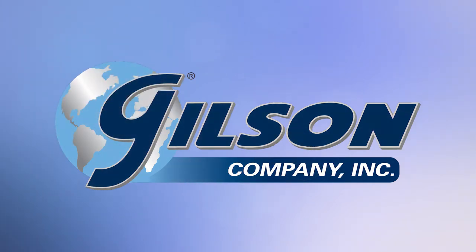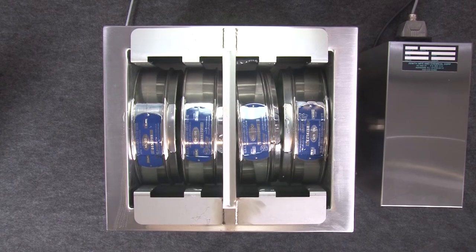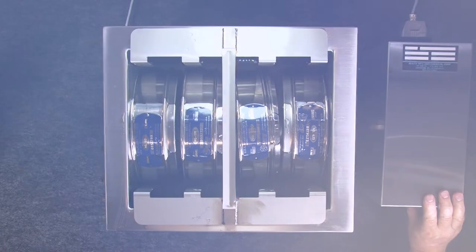Let's take a look at the Gilson UB1 Ultrasonic Cleaner for 8-inch test sieves, that cleans four 8-inch diameter full-height test sieves with energy waves that agitate and free lodged particles.